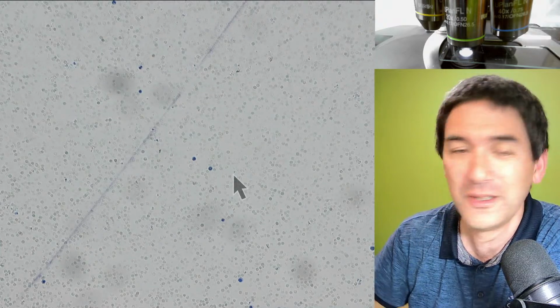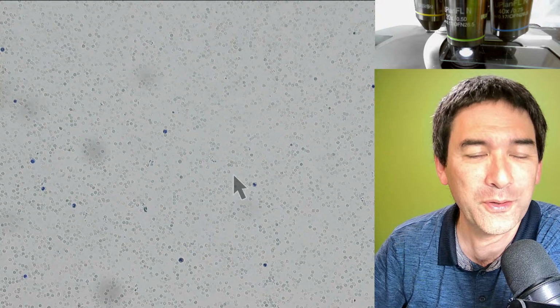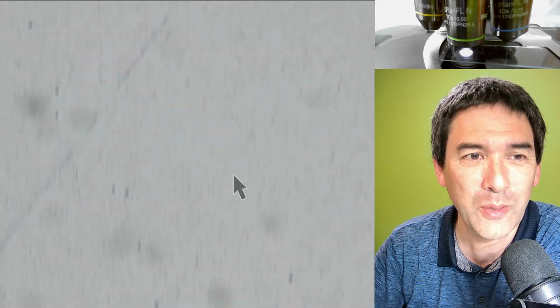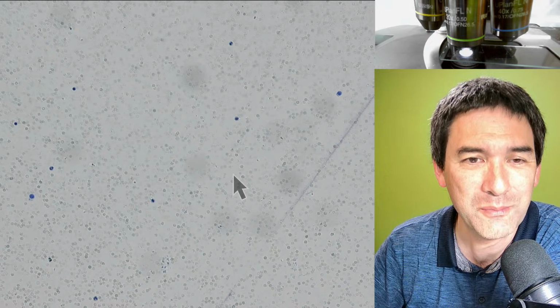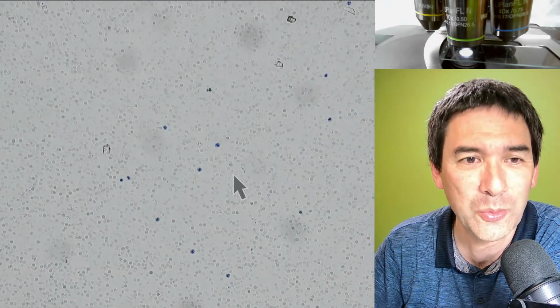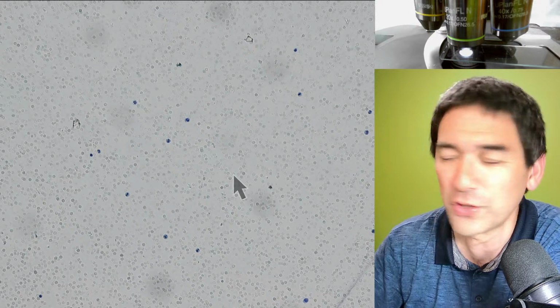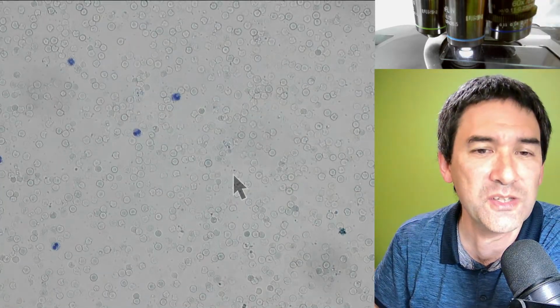Look, here. Now you're actually able to see this. Sometimes it takes a couple of minutes for the stain, the methylene blue, to be properly absorbed. But here you can actually make the white blood cells stand out, and the stain has also caused maybe the red blood cells to pop open and lyse, and then you do not see them quite as well. It also allows you to see how many more red blood cells there are compared to white blood cells. It's also possible to see the blood platelets, which are important for blood clotting, but they're significantly smaller.